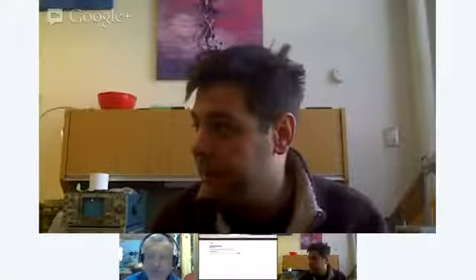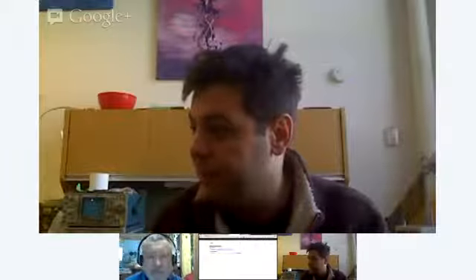Yes. Bob, okay. For people that will look at the video later, I would like to present a little bit what we're doing, just to structure the meeting a little bit. So we're going to do a demo of this new tool that Bob created, which is Lab Notes. We're going to do a tour of the R&D project, right? How to create an R&D project and how to use the Lab Note.